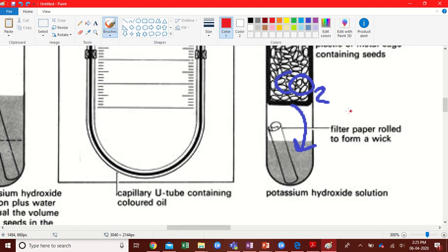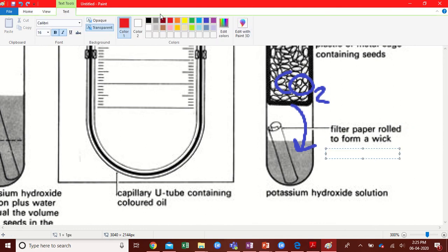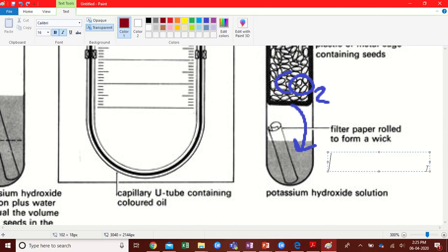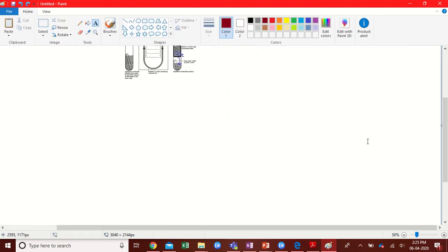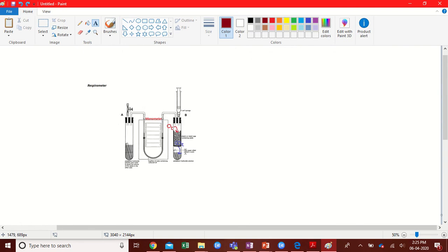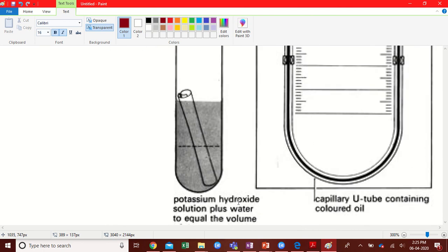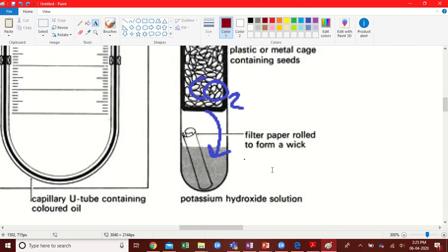The other thing is here they say they've got a filter paper. So the reason for the filter paper is to ensure that, and I'll write it out. So I'll write it in black in this. So ensures. Let's make this box a bit larger. Okay, let me, sorry, one second. There we go. That'll do. So maybe this paint wasn't a good idea. Maybe next time I just won't use it.